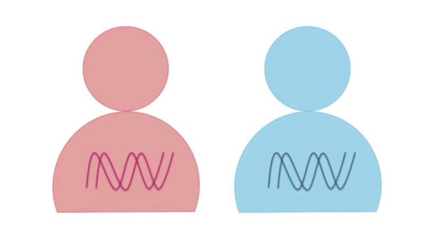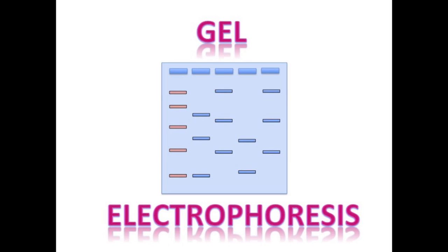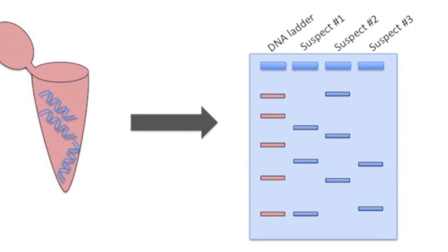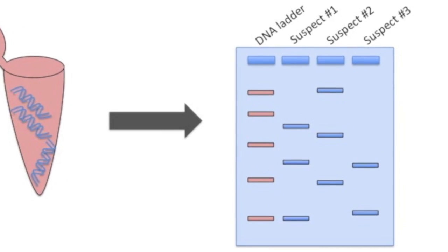Well, since no two people have the same DNA, the hair DNA can be used to definitively figure out who took the painting by using DNA fingerprinting through a process known as gel electrophoresis. Gel electrophoresis is the separation of DNA fragments by size. Today, we will use gel electrophoresis to match the DNA fragments in the hair to the DNA of the suspects.